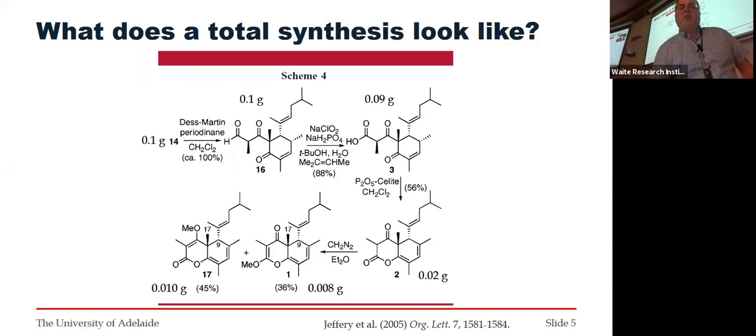And so taking that a bit further, back to 14, that crystal structure, I had 100 mgs of that, and I took it through to this step. And there's lots of stereochemistry involved in that. I'm not really going to get into that. Here's a novel step here, like a dehydration step. But look, now I'm down to 20 mgs. And then I put a methoxy group on here, and suddenly I've got 10 mgs and 8 mgs of this material. So not much to play around with at all. And you've got to do all your analyses on that as well, so HPLC or UV-Vis or NMR. So yeah, you're really mucking around with very small amounts.